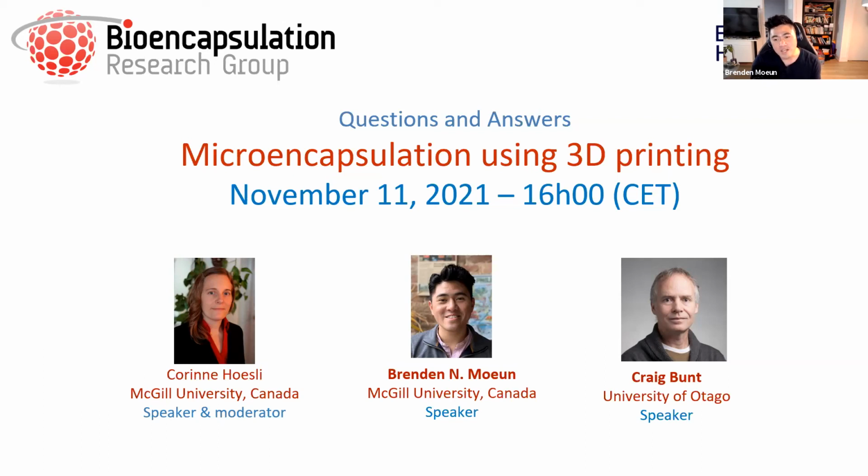Something that you can look at in that case is adding gelling agents in your different layers that would gel the counterpart layers. One interesting idea that I think could be explored, I don't know if anybody's done it, is to use an imaging technique so they can track when particles are coming out of the nozzle to adjust your printing parameters. It would be really interesting to have more feedback control algorithms on 3D printing, and that could address maybe some issues when you're printing larger particles like pseudo-islets. Just an idea, throwing that out there for anyone that's working in the field.